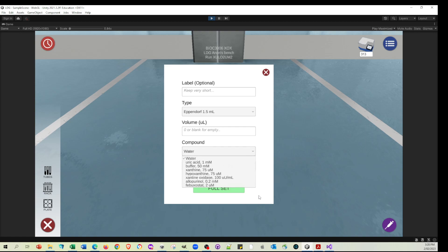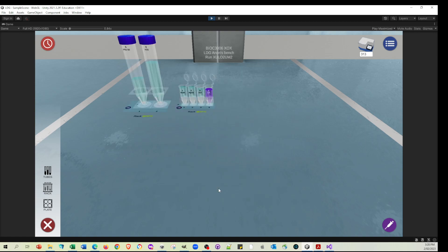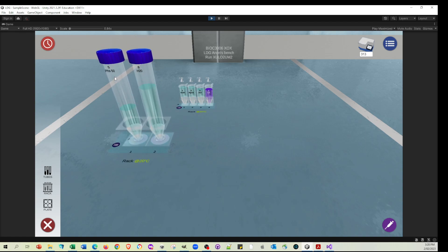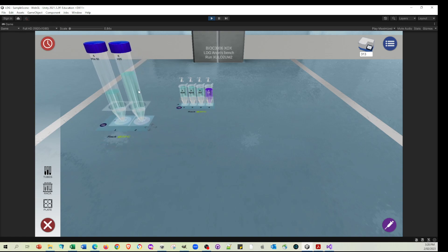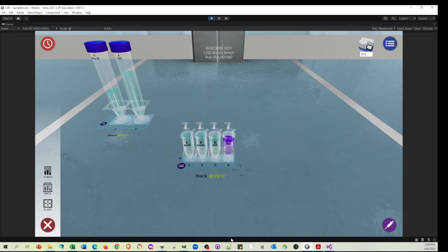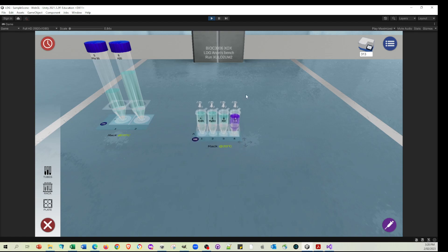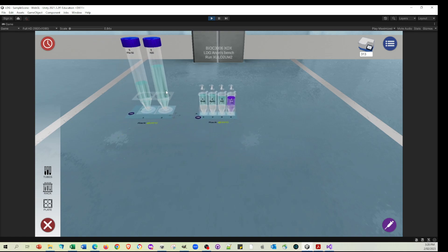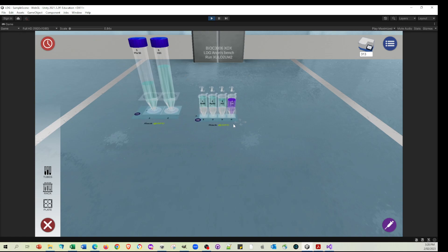We could generate the tubes one by one, but let's just click full set and get a nice set of tubes. We've got the phosphate buffer, 50 millimolar, some water in these big tubes. Then in these little tubes here, I've got the xanthine, the hypoxanthine, the xanthine oxidase, and I've got the uric acid, which I've actually given a little bit of color to. I know that it doesn't have a color, but just for the sake of being able to track things and visually see the output, it's quite handy.